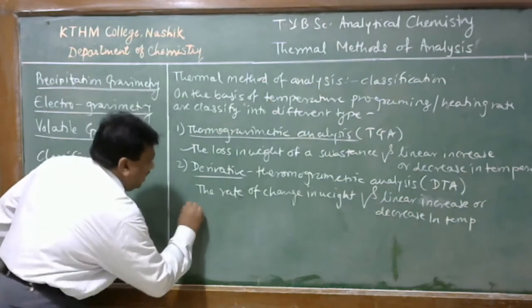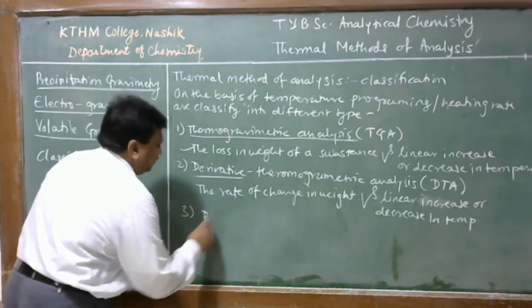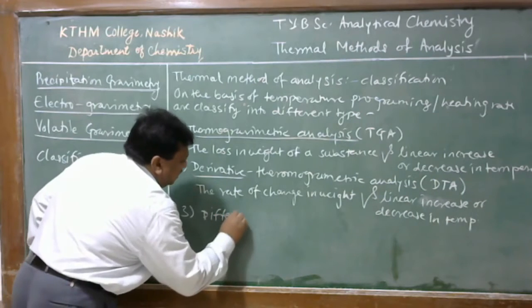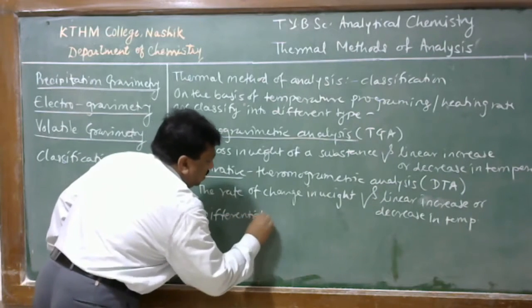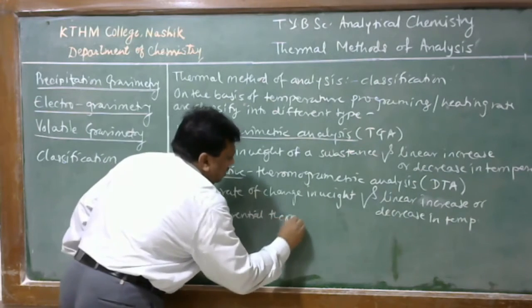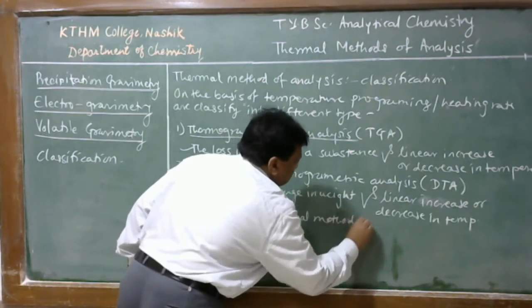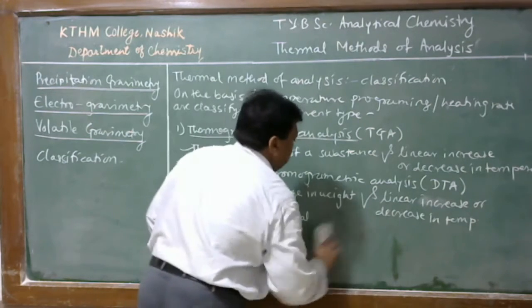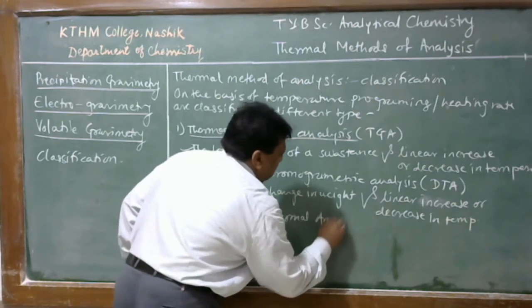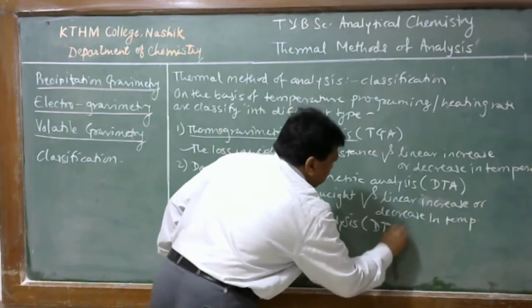The third one is called differential thermal methods of analysis or differential thermal analysis. It is called as DTA.